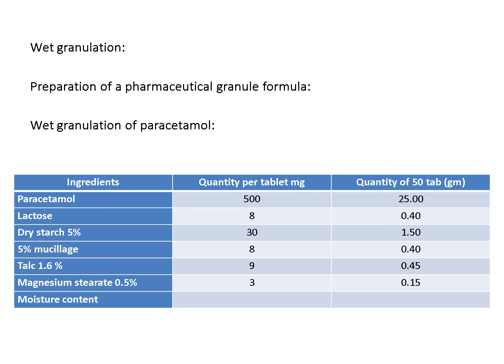So we can divide the 50 ml into three parts: 40 ml boiling water, 5 ml in a small beaker of room temperature water, and 5 ml in a graduated cylinder for rinsing. Starting with the small beaker containing 5 ml of the water, we add 2.5 grams of the starch and stir it. That will form a suspension. Easily transfer it to the 40 ml boiling water, no clumping, no aggregation, and we mix it.